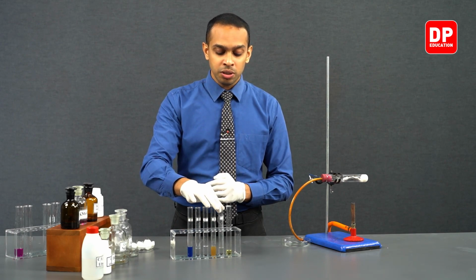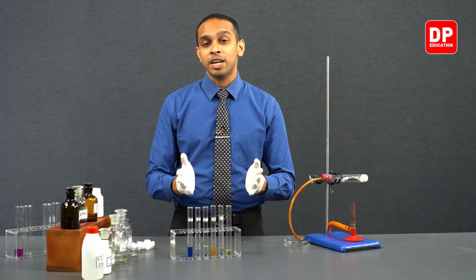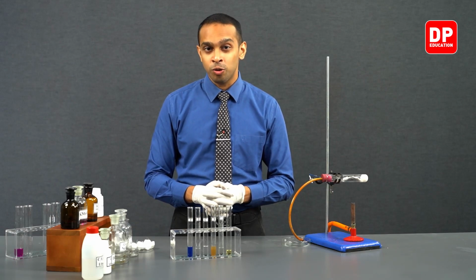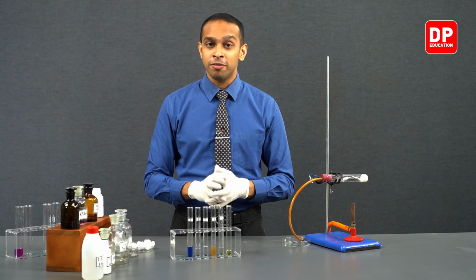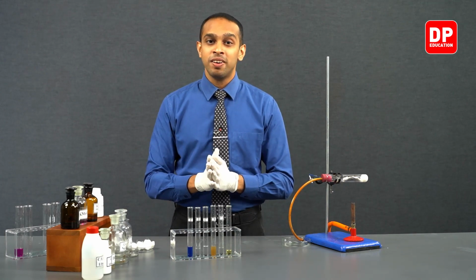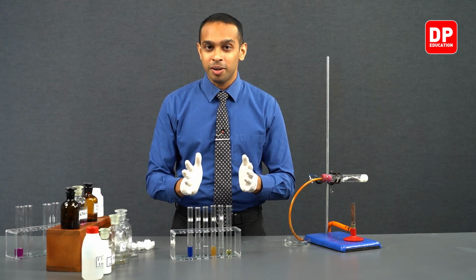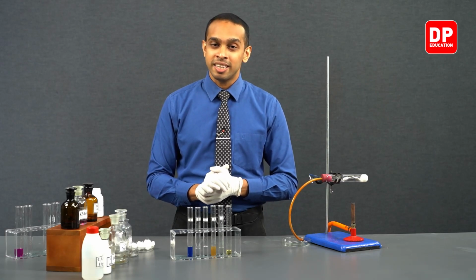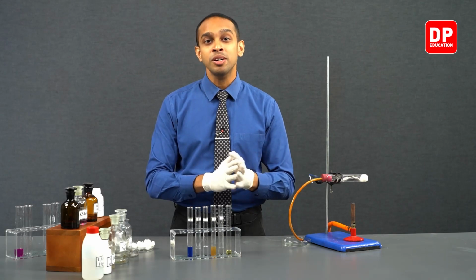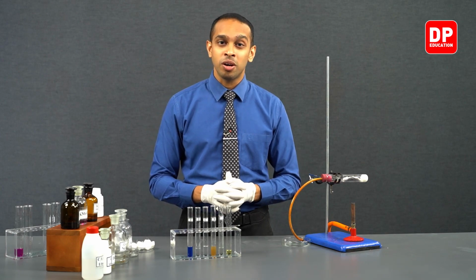So we understood through this experiment that ethene gas will react with bromine water and will decolorize bromine water. In fact, we use the bromine water test to identify hydrocarbons that are unsaturated. Hydrocarbons that have an unsaturation in them, that is, a double bond or a triple bond, can be identified with the use of bromine water.